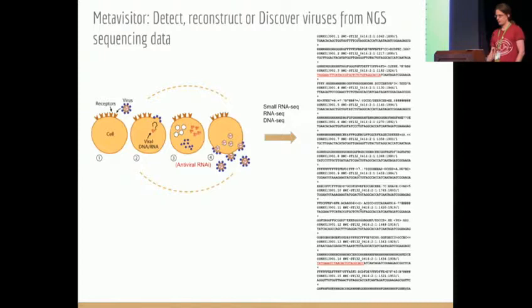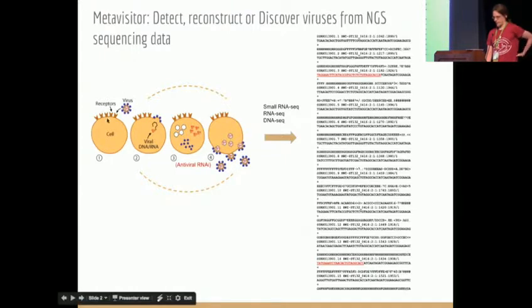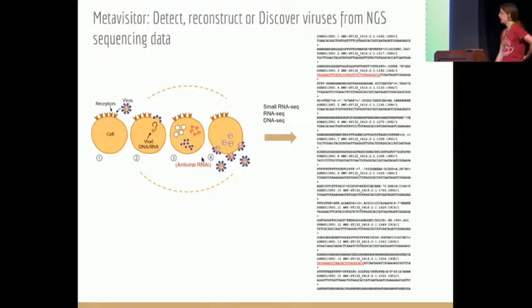So you probably all know that they can infect cells depending on what virus it is and what cell. Usually you have this virus that enters the cell and then it produces some nucleic acid. Well, you have a number of other nucleic acids that may appear in response to that, so DNA, RNA. And that's the stuff that we can sequence, right? So why not use that to figure out what's present? And maybe we can even find some unsuspecting things in NGS datasets.